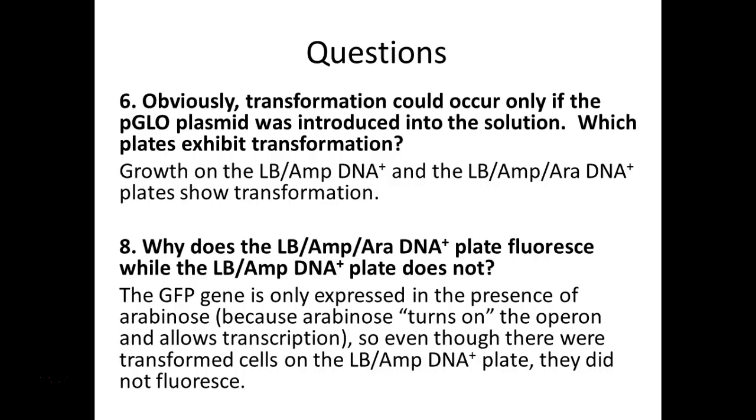Is it still considered transformation then with the ampicillin plates? Alerica asked an excellent question. She said, this other plate, the DNA positive plate with ampicillin, are those still transformed cells that are growing on that plate?